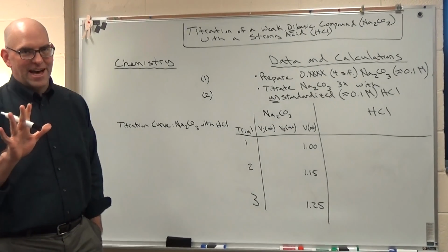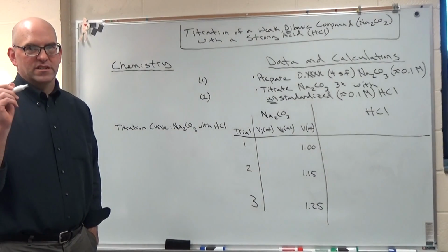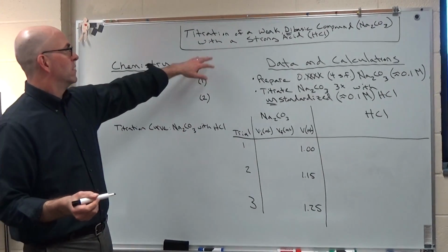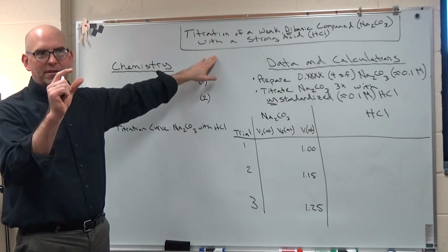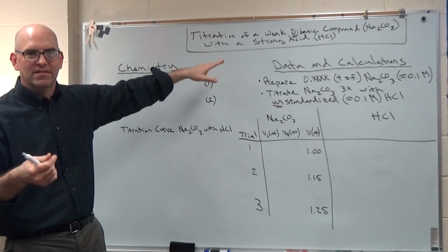Okay, hey Dynamics Lab, we're just here making another supplemental video, and this is really just a supplemental video to go along with the pre-lab for tomorrow's lab for titration of a weak base with a strong acid. First thing, I think I got that backwards on the title of the pre-lab. I think I put weak acid with a strong base. It doesn't really matter, so I think I messed that up.